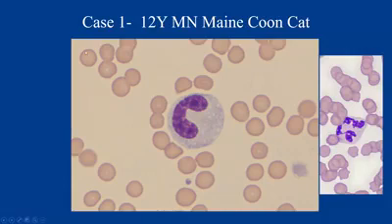Now there's some disagreement amongst pathologists about what constitutes a band and what doesn't. Some people say the walls of the nucleus should be perfectly parallel, and if there's any constriction at all, like maybe there's a little bit right here, then it's not technically a band. Other people say that this constriction can't be less than two-thirds the area of any other part of the nucleus. So it's really just about being consistent with your morphologic identification.